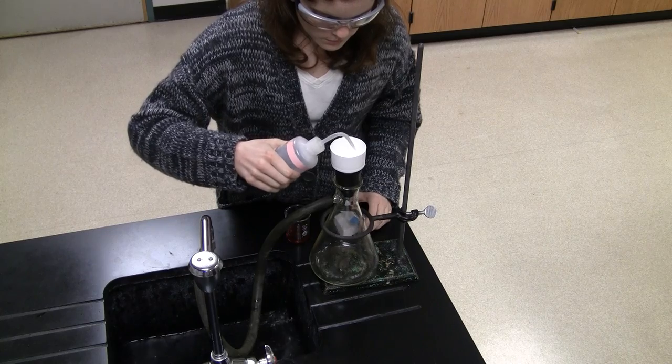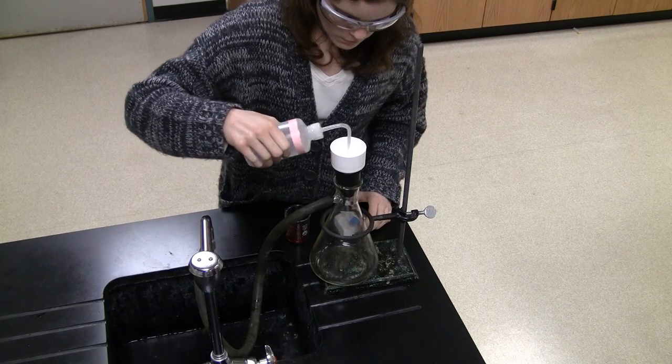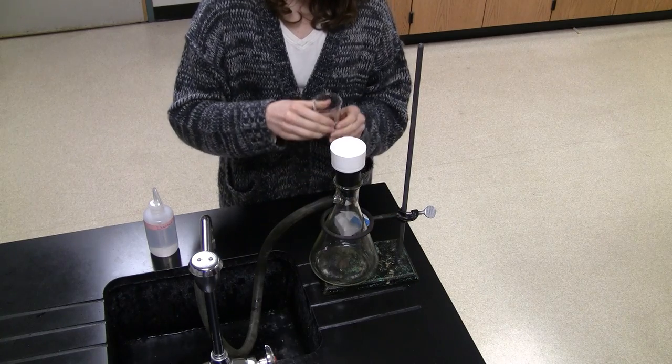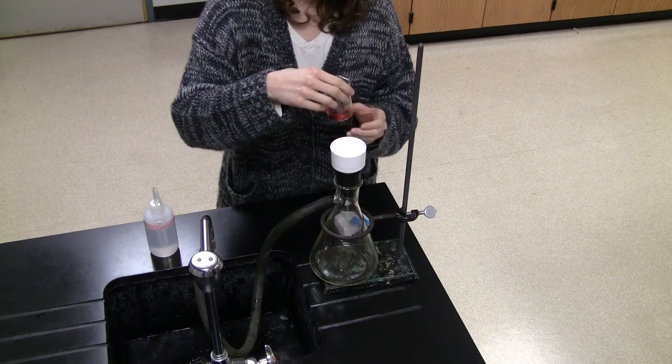While pulling suction from the sink, wet the filter paper with distilled water. This allows the paper to make a better seal to the Buchner funnel, so no solid can flow around or under it.